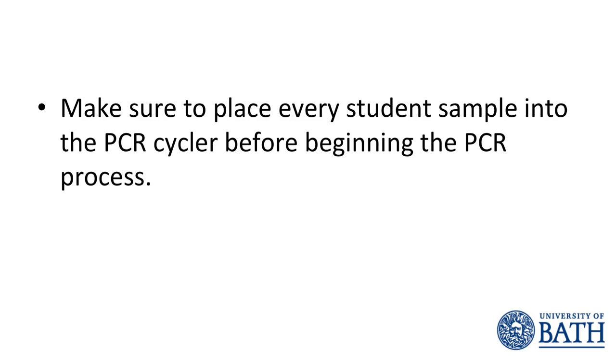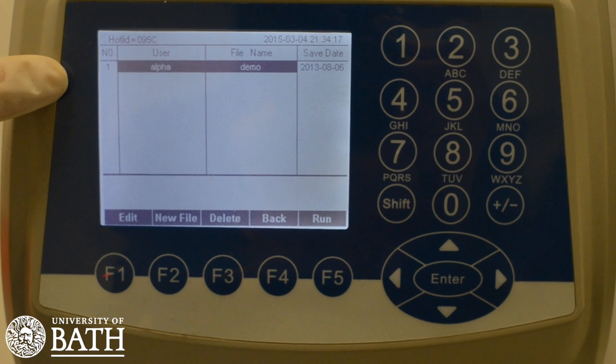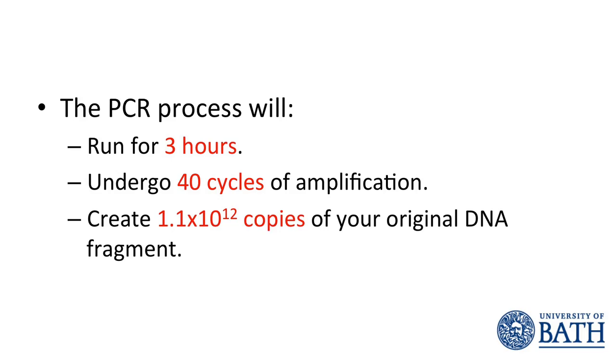In a classroom situation, all students' DNA samples will be placed into the PCR cycler at the same time. Make sure that the correct PCR program has been selected on the PCR cycler and then push the button labelled Run. This will begin the PCR process that will run for 3 hours and undergo 40 cycles of amplification. When this is complete, the PCR tubes can be removed and their contents analysed in the next lesson.